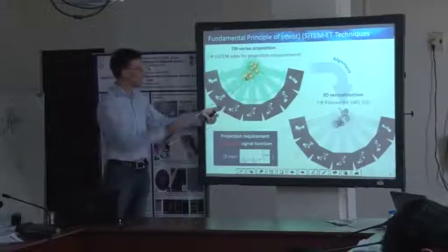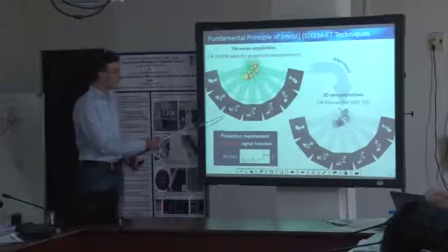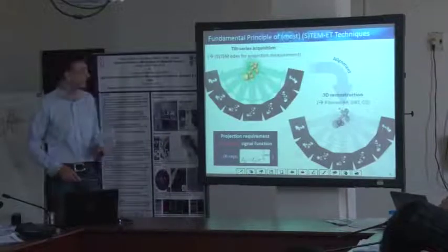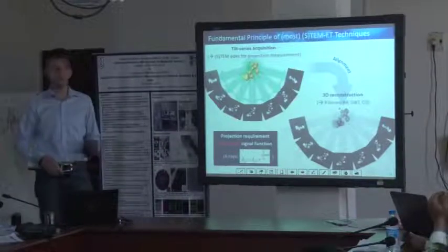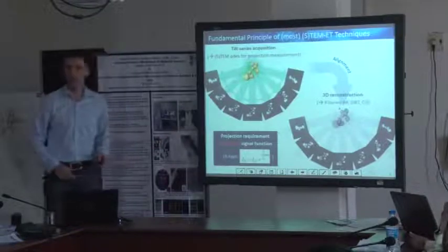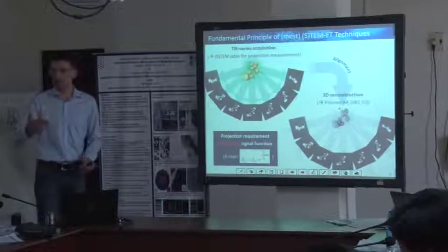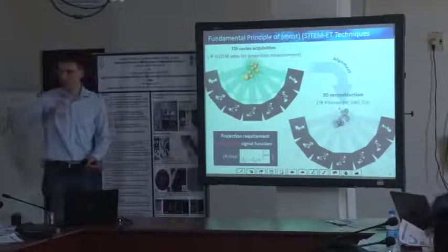In this particular case, this is gold particles on the carbon support film. I applied dark field STEM imaging to record because it shows a very nice contrast. As you will see later on, there are some challenges depending on your imaging condition. In this particular case, those are polycrystalline particles, and you can easily imagine that whenever you tilt a particle which is crystalline, then in conventional TEM imaging mode, you might end up with some diffractive intensities and intensity fluctuations.